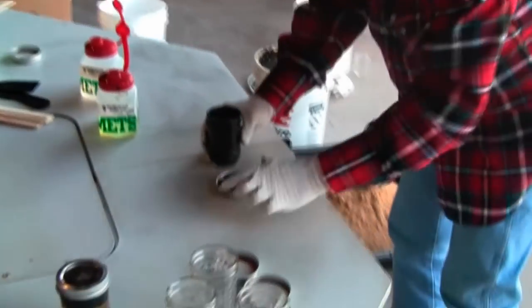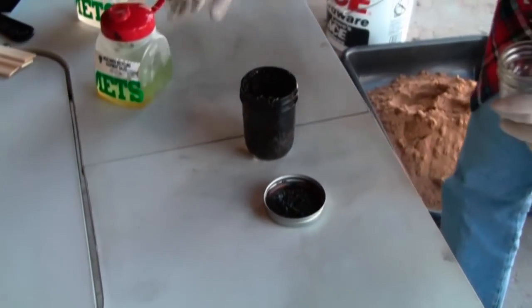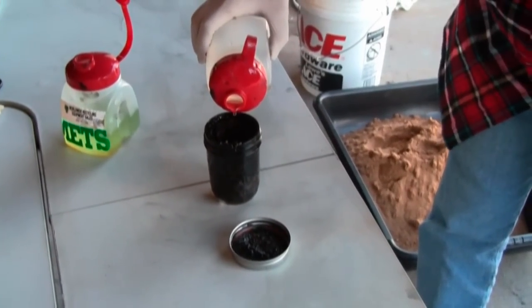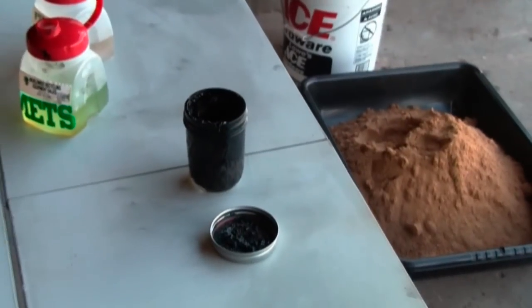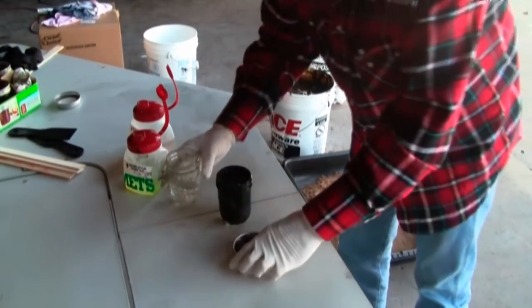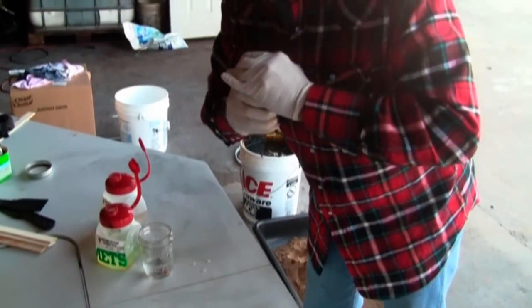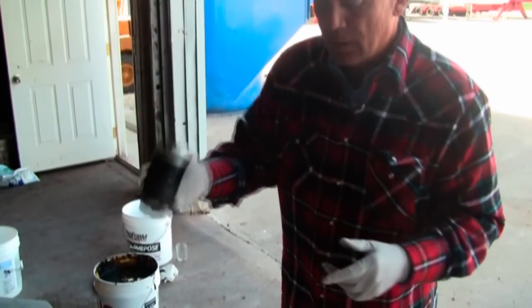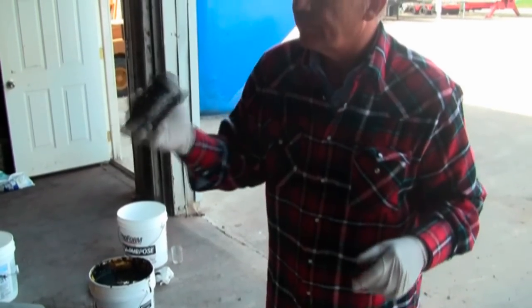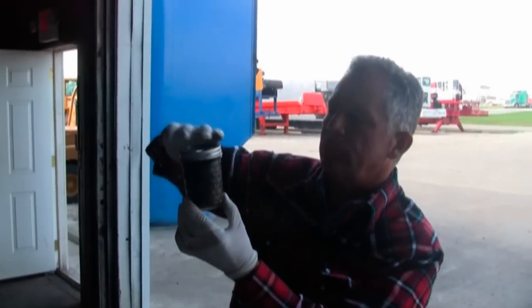We're now going to add some surfactant — a small amount of surfactant — along with some water, and top this up. What we're trying to accomplish is a physical separation of the soil from the oil by shaking the surfactant and water together. As you can see, you're beginning to see color — the brown is appearing and the oil is surfacing out of the sand.